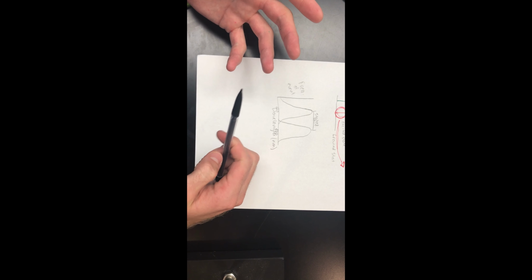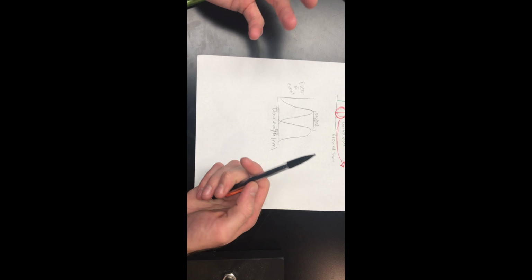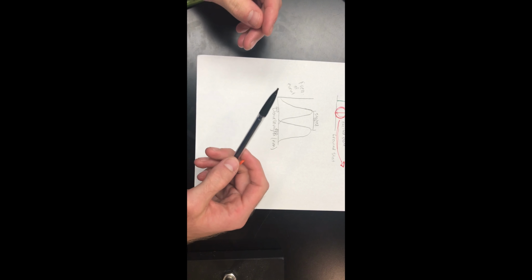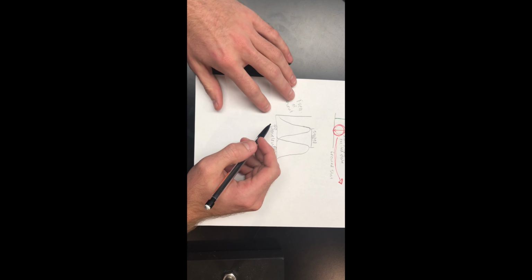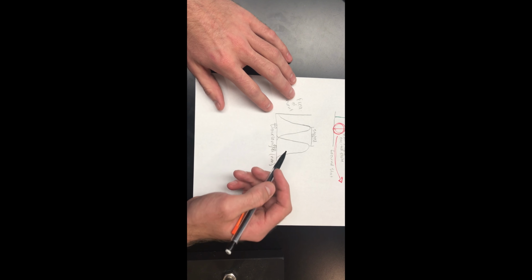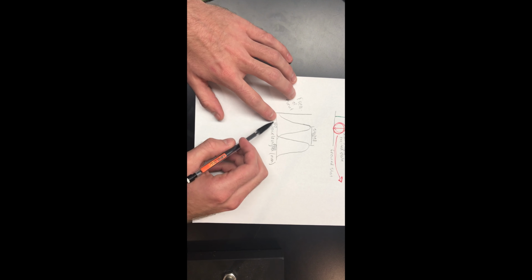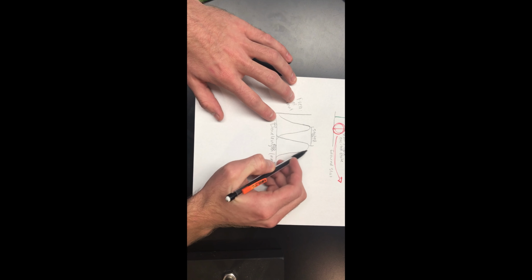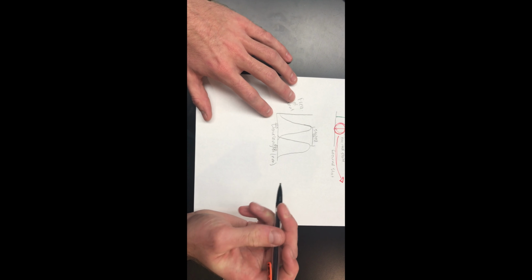It would be pretty inefficient to try to excite a fluorophore at anything other than its optimal excitation wavelength. Let's say we're looking at Evans blue. It would be inefficient to try to excite it at a wavelength other than 620, because when we're exciting at 620, we're getting an optimal emission at 680 nanometers.